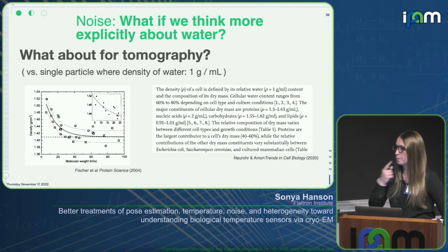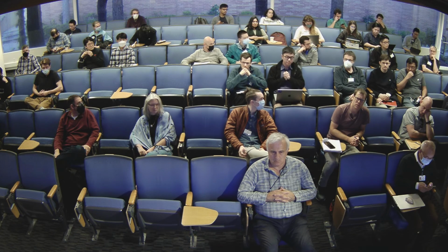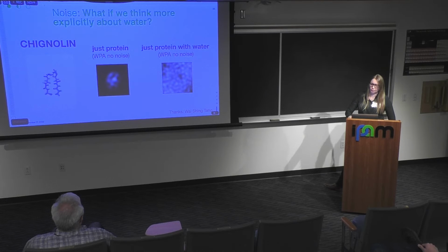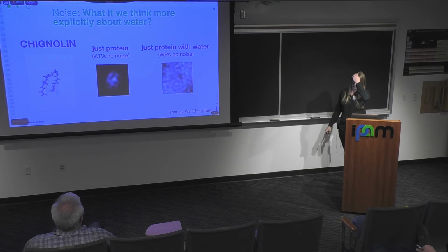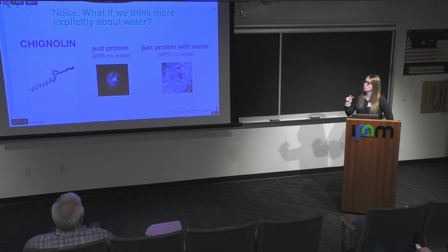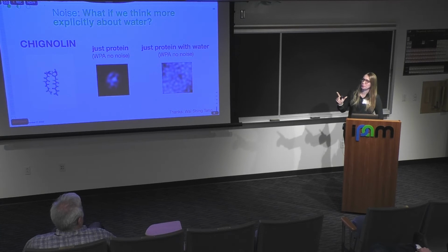So just to understand, when we go back to the small molecule that you had... Sure, this one is here. Basically, you don't see it anymore because it is moving so quickly within the water. No, this is just a snapshot. In the water, which is sort of randomly distributed. This is just one snapshot of the protein.